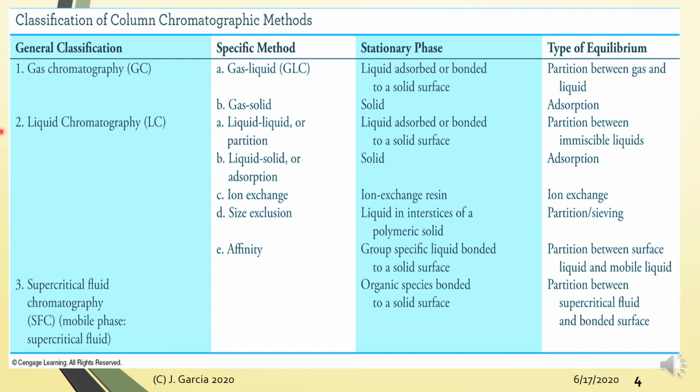For instrumental methods, liquid chromatography is referred to as HPLC, high performance liquid chromatography, wherein the mobile phase is pushed by high pressures along a narrow column, which makes separation processes faster and in general more efficient compared to gravity liquid column chromatography.